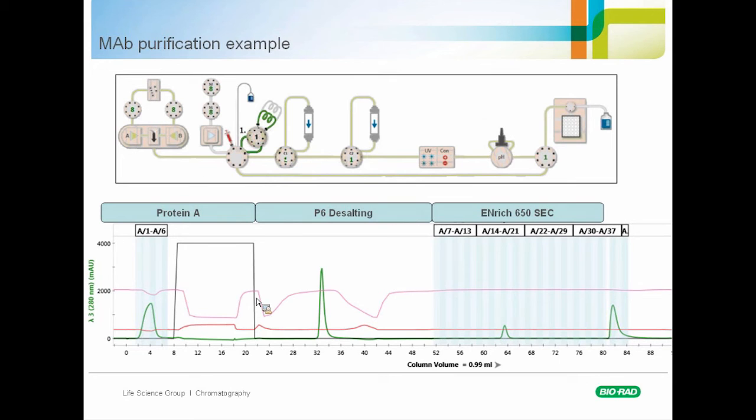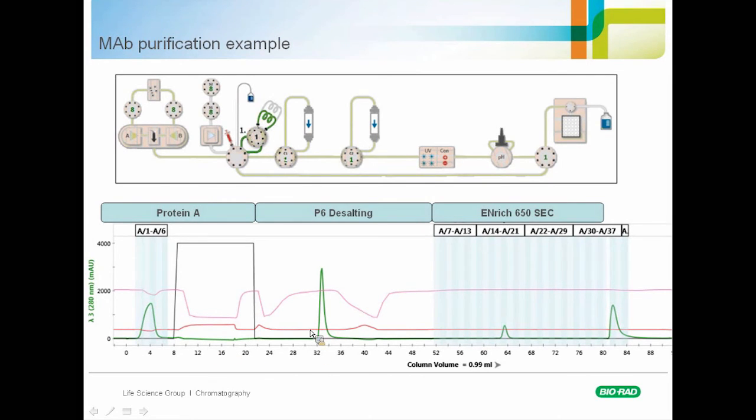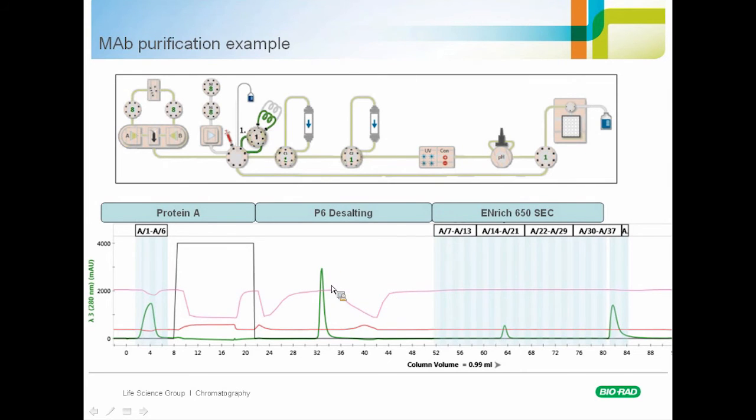What we see to the left of the monomer peak is then the aggregate peak. And we can see here the differentiation between the different levels of aggregation. So this is reproducible, it's consistent over multiple columns, and it still gives you good analytical data to be able to differentiate and determine relative levels of aggregation of the antibody from a CHO cell line.